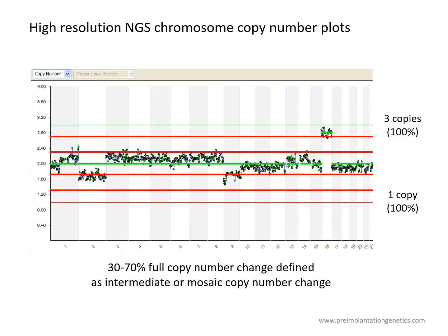And so that really shows you the difficulty of, do you call those as mosaic changes, or are they only a result of noise? It clearly looks, because there's a step change from 2 copies, as though there's definitely some kind of aneuploidy in the sample. So we use these thresholds, 30 and 70%, as a starting point for our analysis.